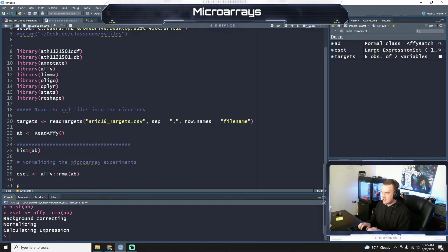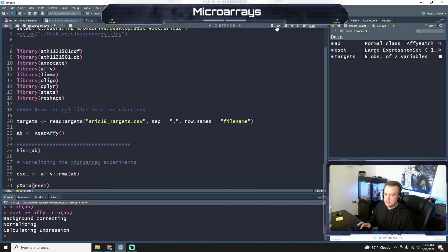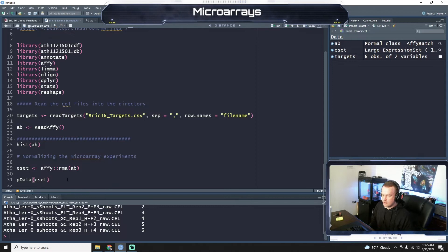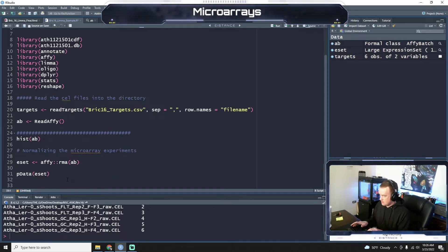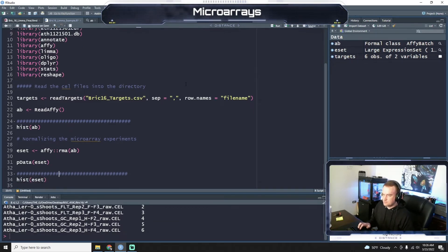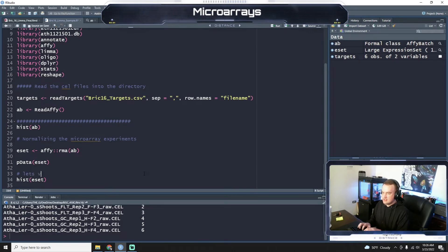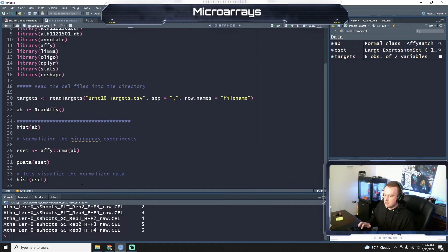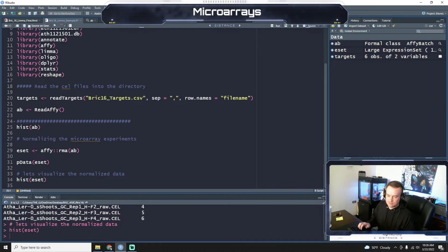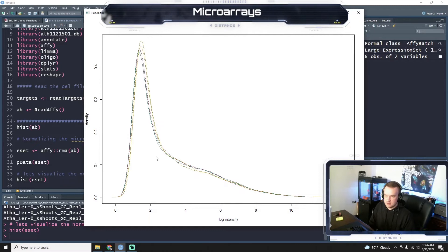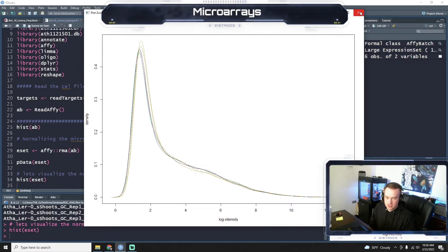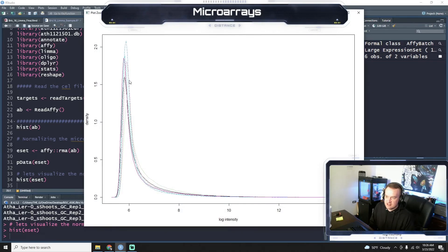And now let's plot the data, pdata, for ESET. Okay. Actually, so run that function. Now we're going to plot the data. Okay. So we're going to do histogram of ESET. Let's actually annotate our code. So let's visualize the normalized data. Okay. Now let's run it. Okay. So now if I zoom in on this new graph that's under my picture here, you can see that compared to the last graph, it's a lot tighter of a fit of these experiments over one another.